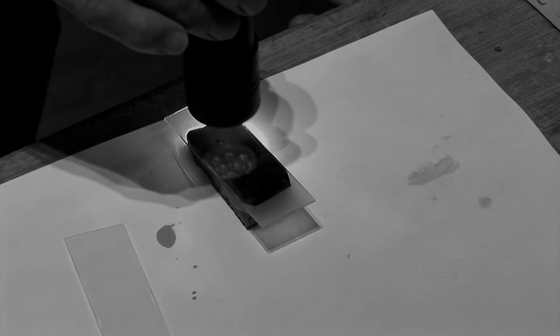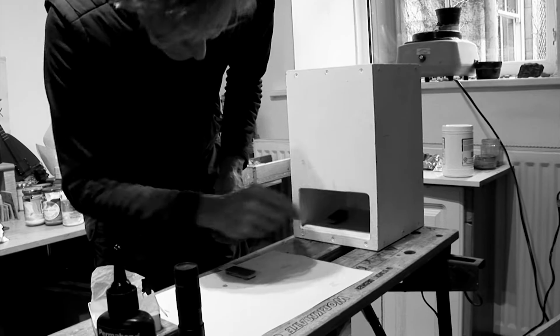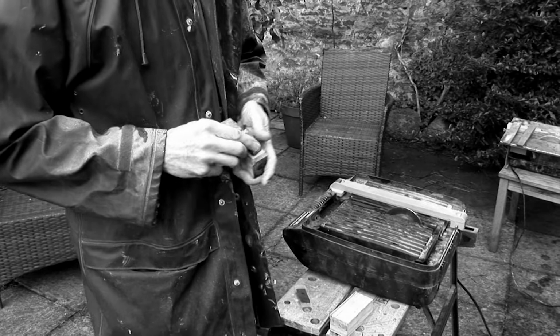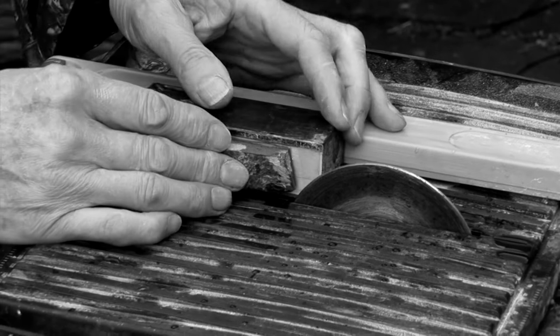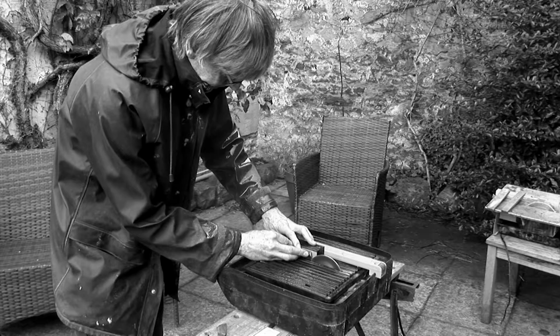And I'm going to put it into this homemade UV light box, which has got a stronger light than that one. I've made this little block, and the slide fits in there, and then that's just going to leave enough showing to leave less than a millimeter of rock left on the slide. And then after that we'll thin it down till it's less than a hair's breadth.